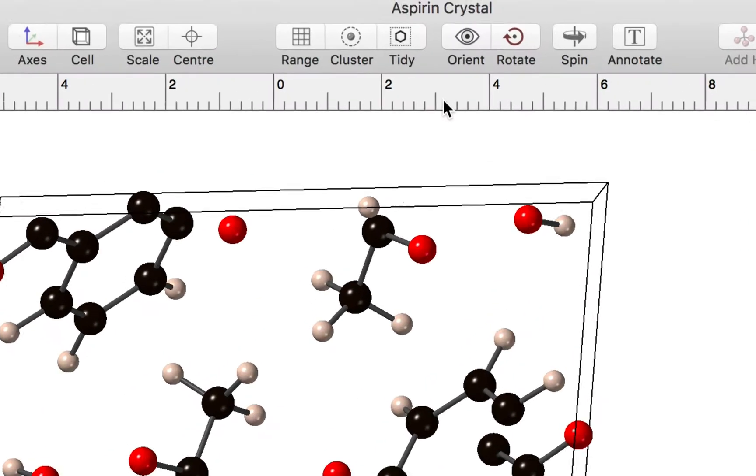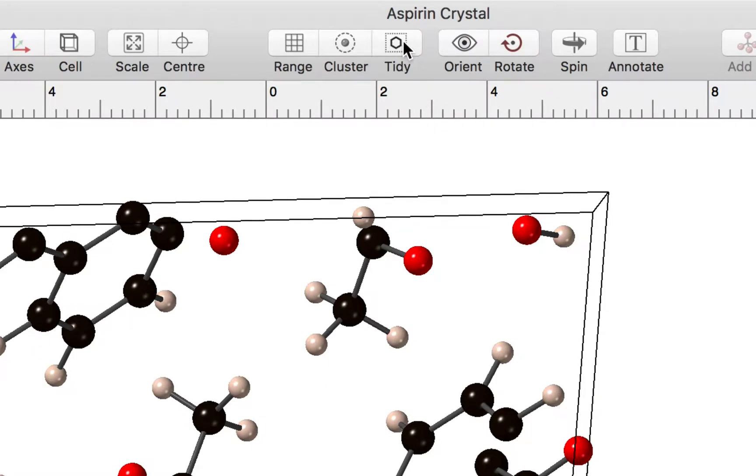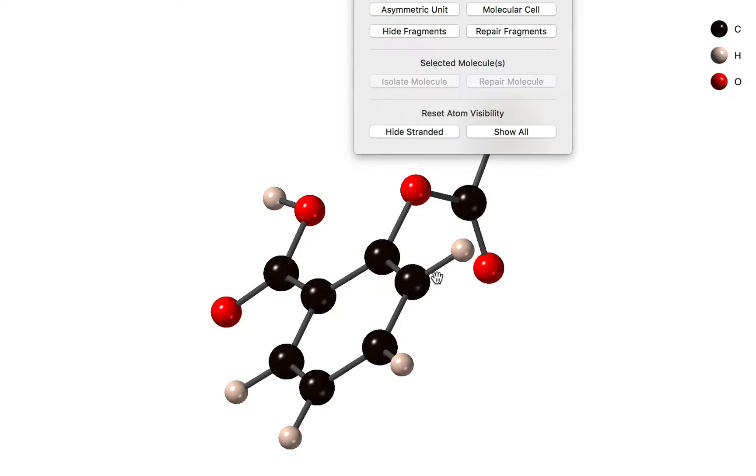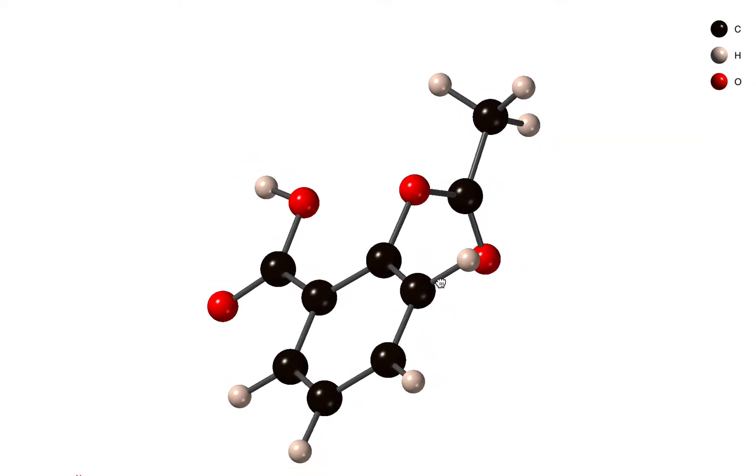If we move to the Windows toolbar, you'll notice there is a tidy button. Clicking that displays a popover with some handy commands. The first thing you might want to do is click on asymmetric unit, and for this structure the asymmetric unit consists of a single molecule.